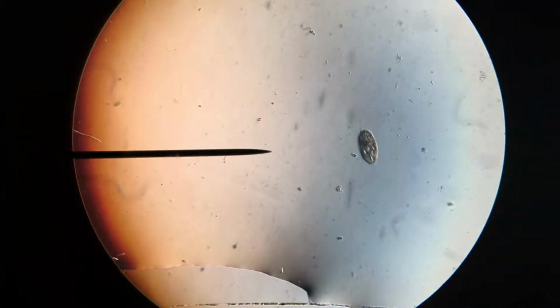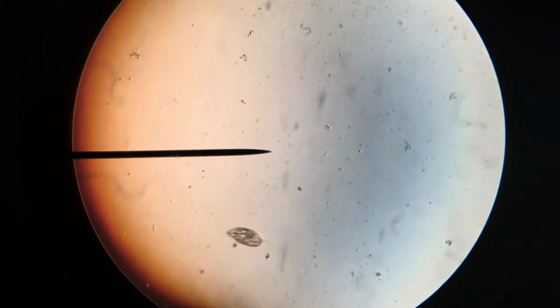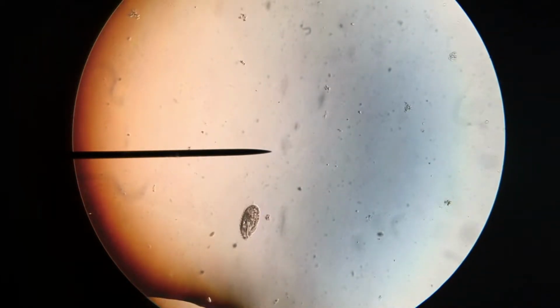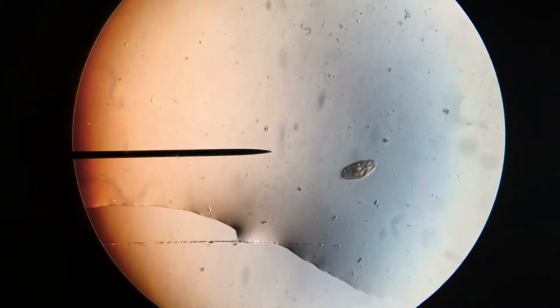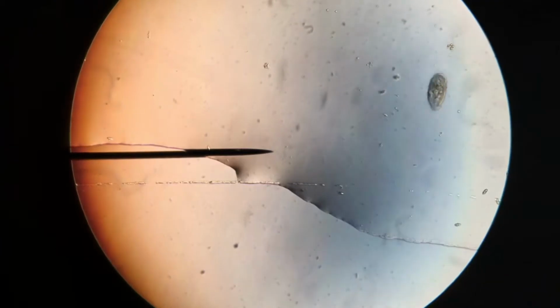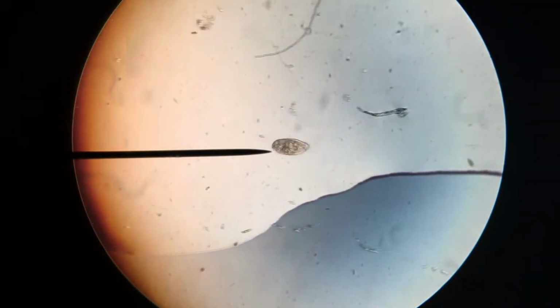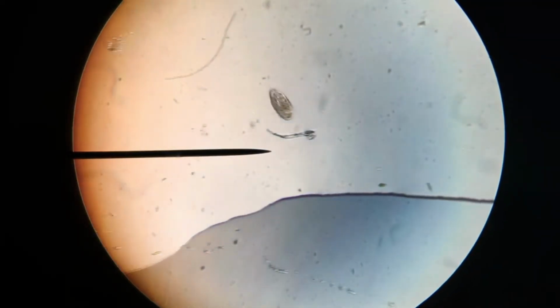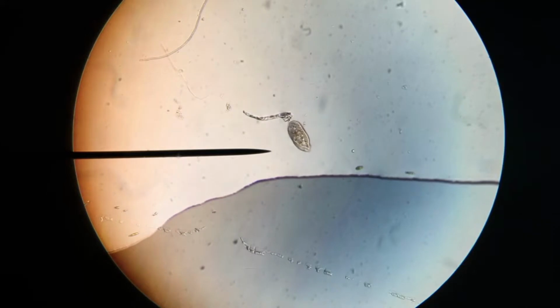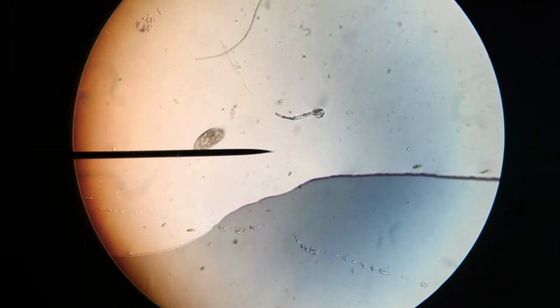Oh, hello. Now this little guy, I believe this is a stylonichia. Hello. Wow, this is pretty good. You can actually see that it's a ciliate. But it's got a couple of modified cilia sticking out of its rear end, like bristles.